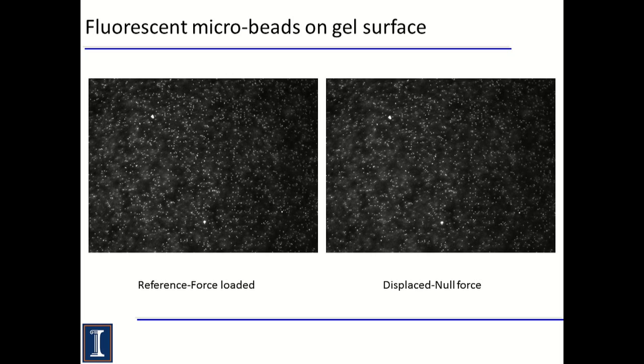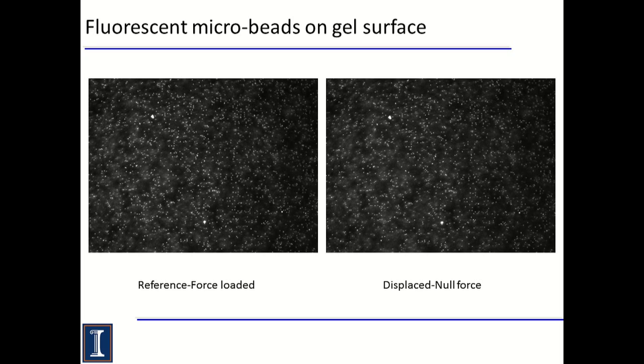The reference and displaced bead images obtained after the SDS treatment are shown here. The bead images are compared to determine displacements by searching a matched area with multiple pixel points, such as 30 by 30 pixels. This area, usually called a subset, has a unique light intensity distribution called gray level inside the subset itself. It is assumed that this light intensity distribution does not change during deformation.